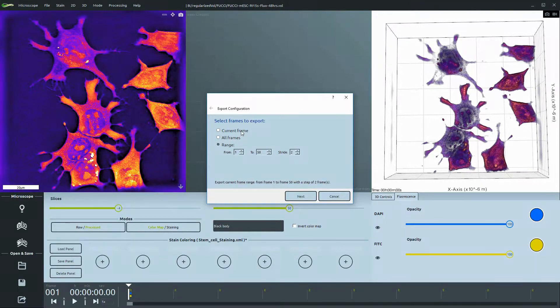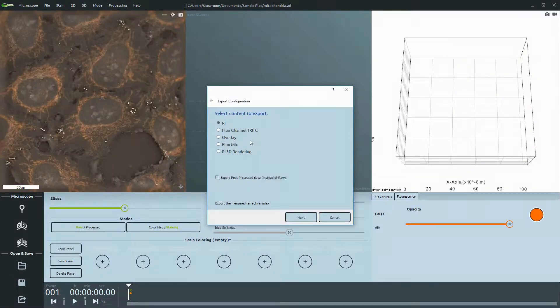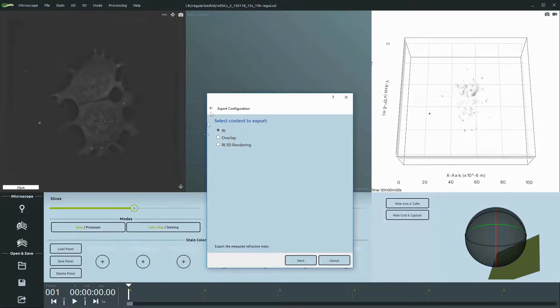This is user-friendly and only shows the options which are compatible with your dataset. So if you aren't working with a dataset containing fluorescence, then the export options for fluorescence won't appear.